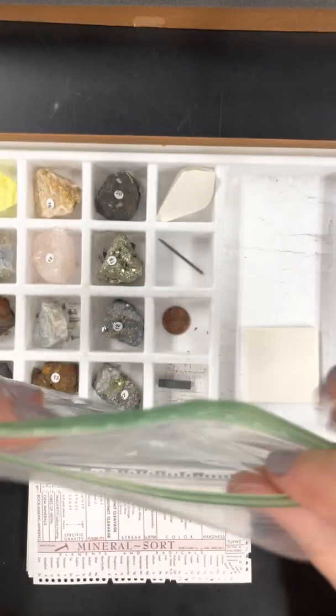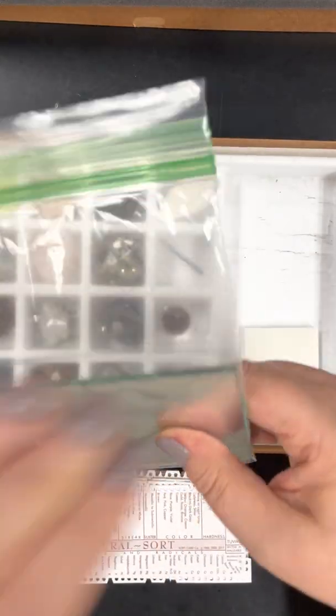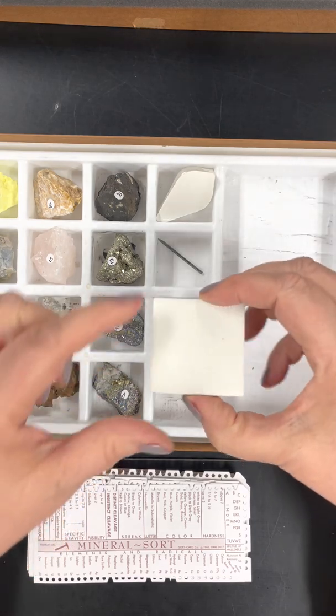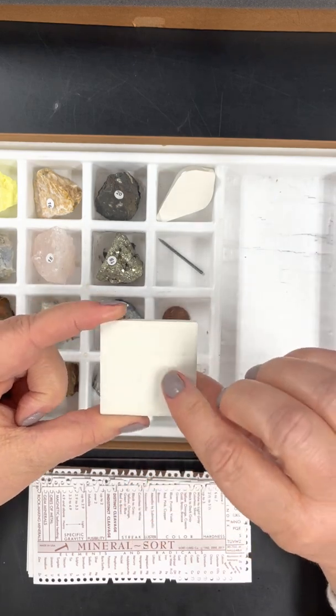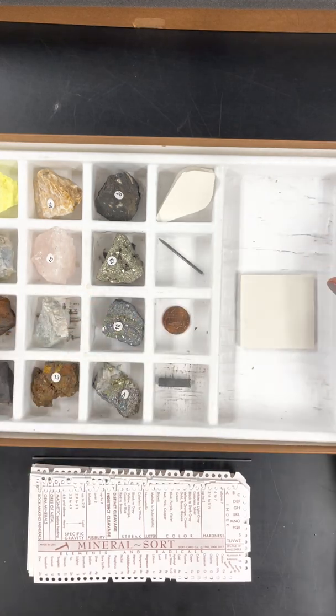If you break this on accident, accidents happen. If you break it, please let somebody know immediately. I do not want you guys picking up the pieces. And the last thing I have in here, this is an unglazed tile. And this we're going to use for a streak test. Okay, so let's go ahead and get started.